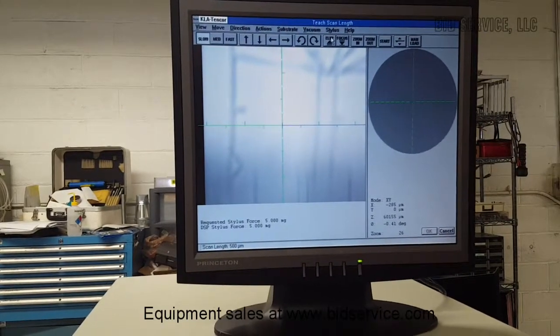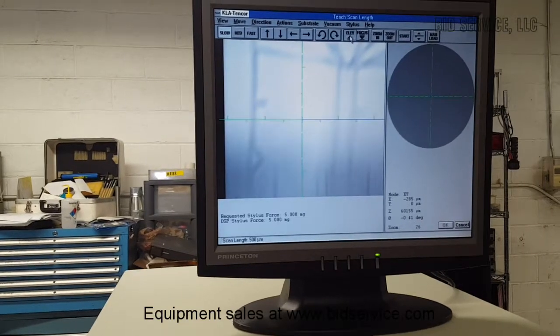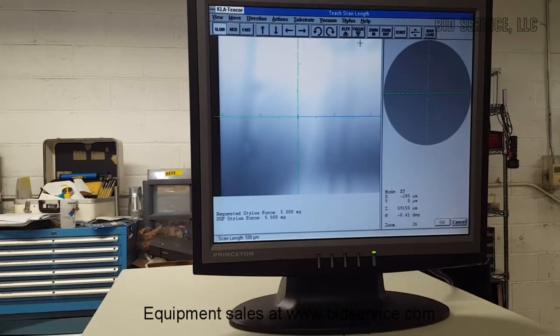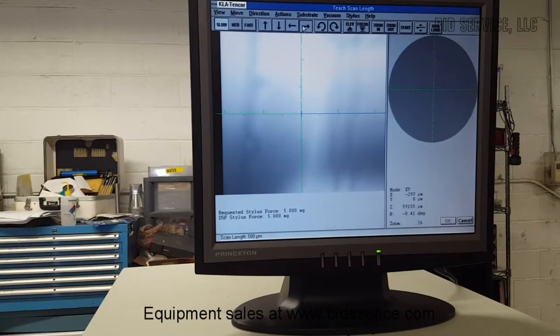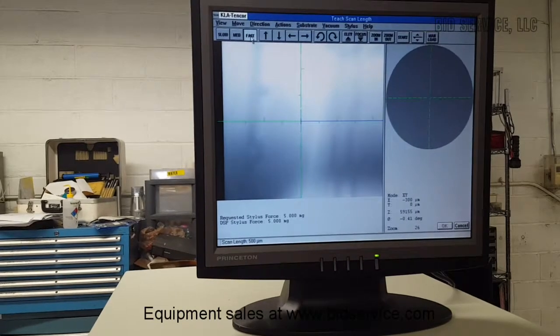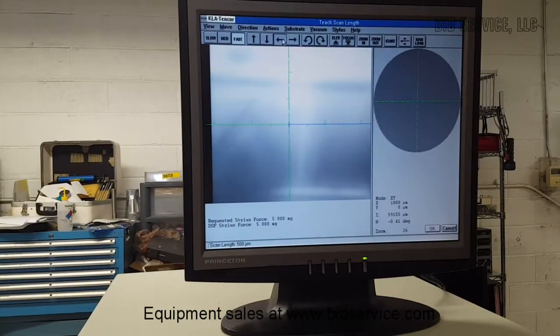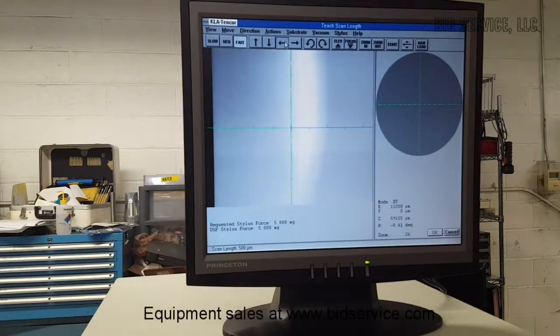And then I'm going to go to a standard which is 1.8 microns, and I raise the elevator slightly, and then I'm going to select the faster speed and move this sample so that I will be able to focus it on the next sample.